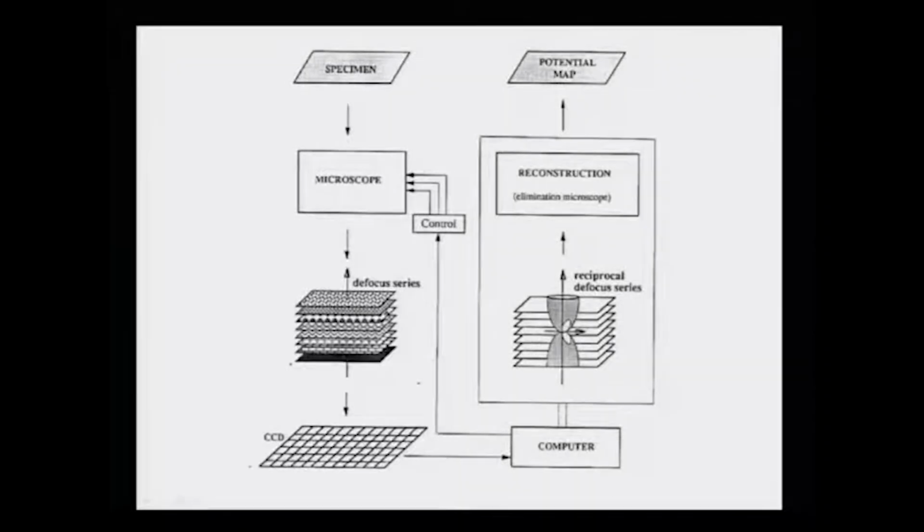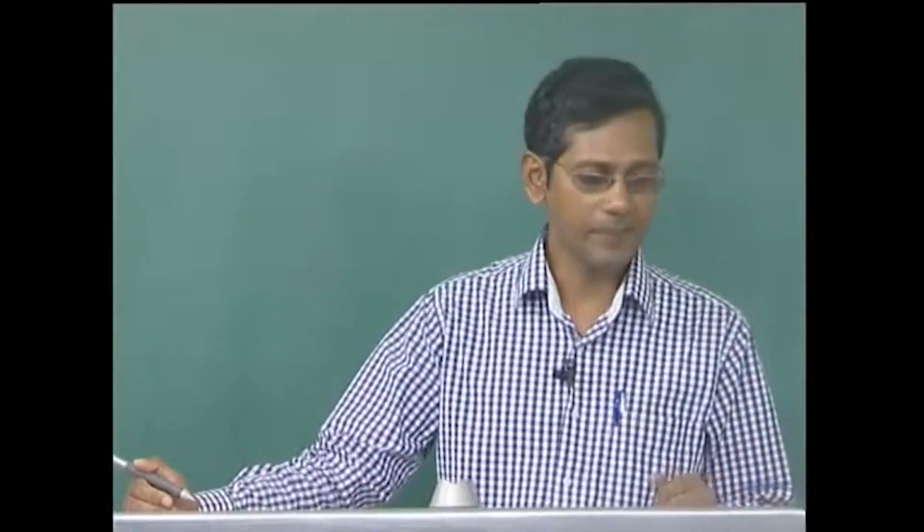An input to such a multi-slice method obviously has to contain different parameters of the specimen or object, like the unit cell, the positions of the atoms inside the unit cell, the thermal factor, the Debye-Waller factor, because of the vibration of the atoms as the temperature increases, the orientation of the specimen or crystal, as well as the thickness.